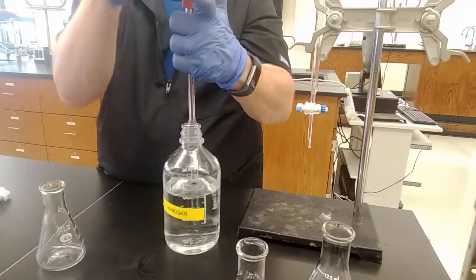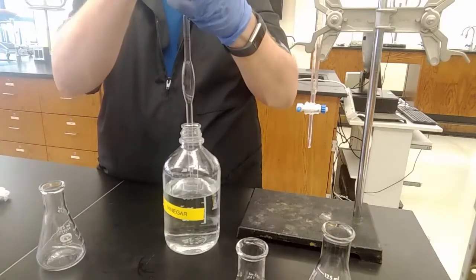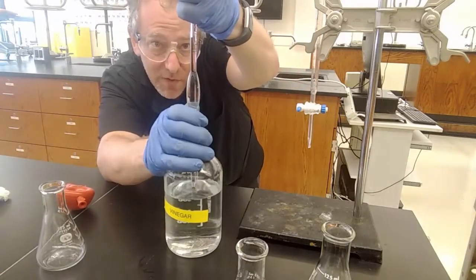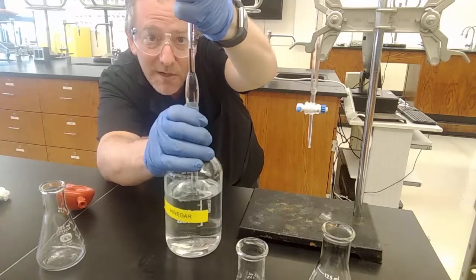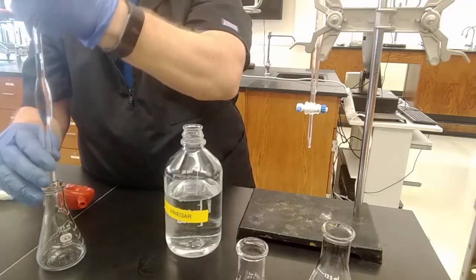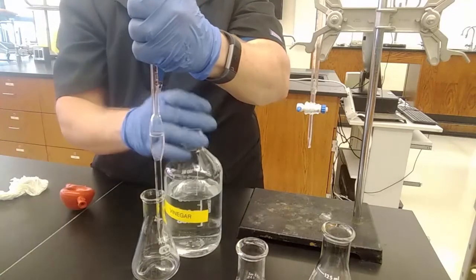Three of three. And past the line, if I got an air bubble or something in there, I would just let it drain out and start over again. Again, you get back down to eye level, rotate my thumb off very, very slightly. You can move the meniscus down incredibly slowly until it's exactly on the line. I'm done. Wipe off the outside just in case there's anything goofy going on and let it drain on its own into Erlenmeyer flask number three.